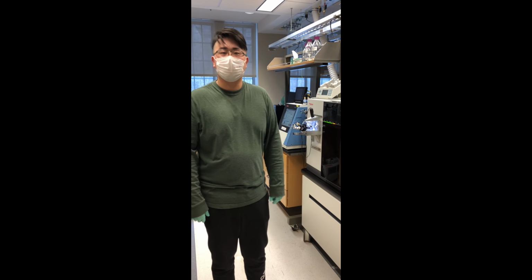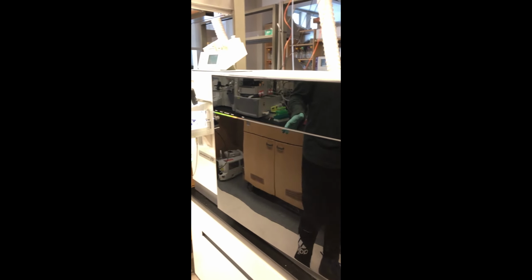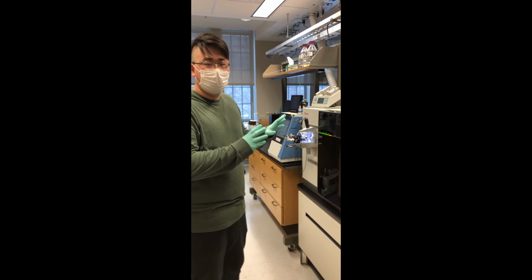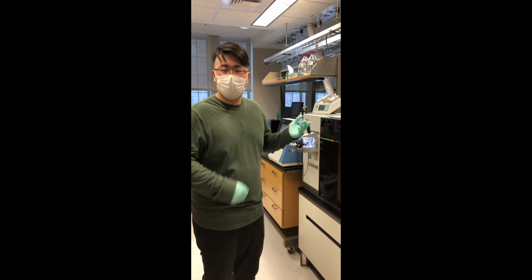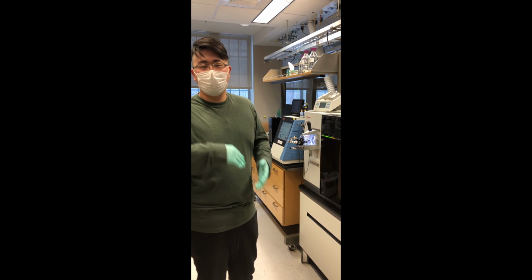this. I'm Gu, a fourth-year grad student in Jacobson's lab. This instrument is our detection instrument for our glycans. It's called Orbitrap Fusion Lumos, a very advanced instrument. With this instrument, we can detect very small molecules with very high resolution. It helped us to achieve what we wanted for the cancer screening and also for our phylotox project. The phylotox project will focus on some molecules, including lipids, sugars, and amino acids, and we'll talk about that in the next chapter.